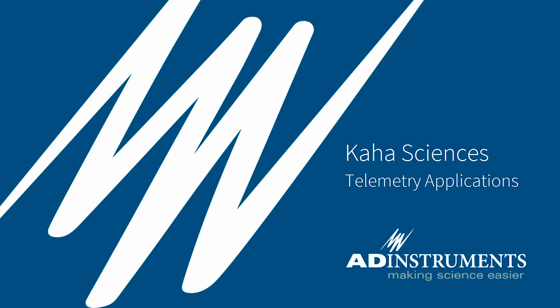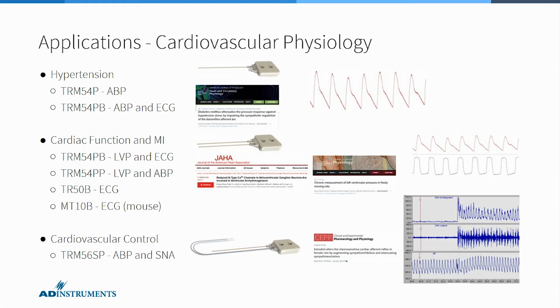So the last part of the webinar, I'm going to talk through some applications of the telemetry system, both the rat and the mouse system, and also highlight some publications from customers, which are pretty nice.